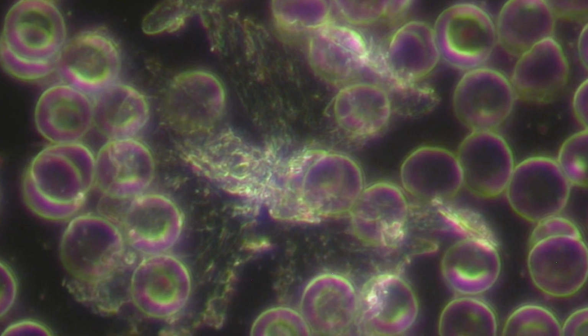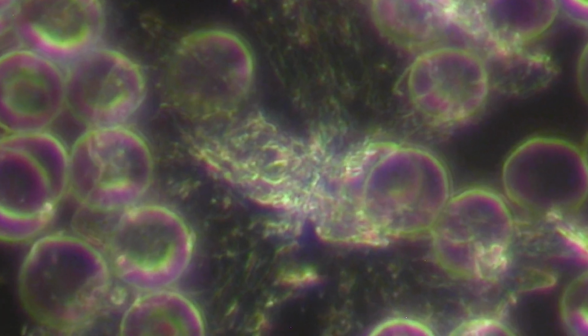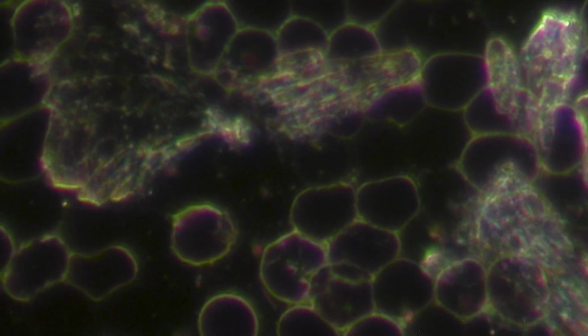We saw some very interesting things that looked like rocks or crystals of various shapes, and it was a bit alarming because the fluid in the vial looked pretty clear. We couldn't see anything with the naked eye, and that's why we used a microscope to evaluate it. I have since seen those same structures in numerous blood samples that I have evaluated over the last 3 years.